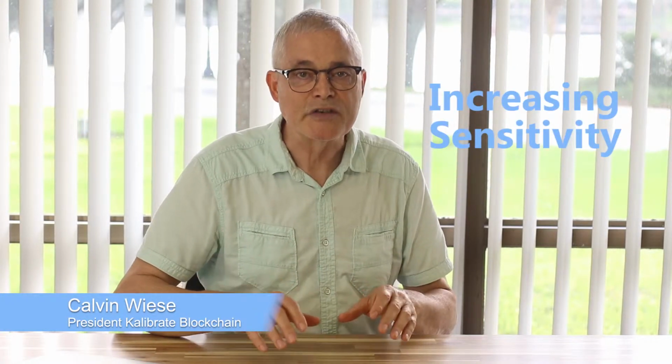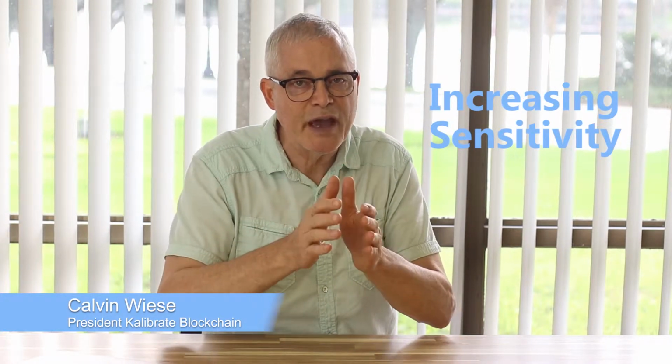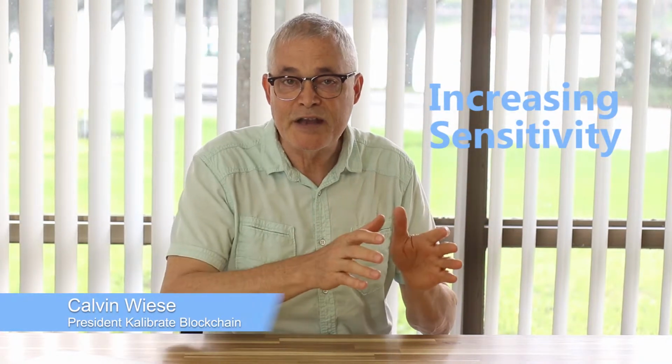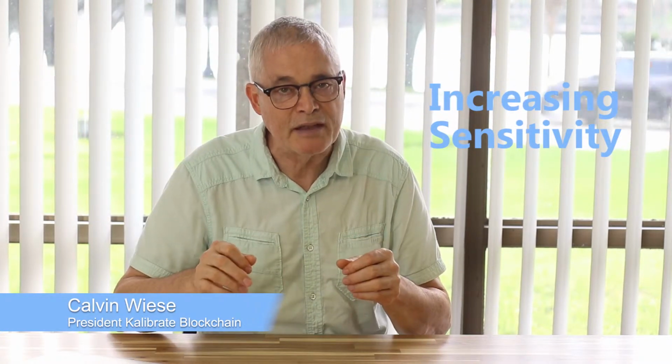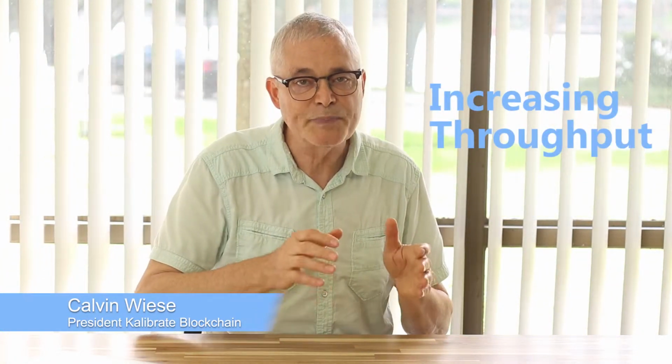Dr. Yost taught us that we can increase sensitivity by getting the analytes closer together. So if we can isolate the analytes from the other molecules in our isolator and then remove most of the solvent carrying the analytes, we can achieve the high sensitivity we seek. Dr. Yost also taught us that mass spectrometry instruments are idle most of the time. As much as 99% of the time they're idle. During that idle time, the instrument is waiting for the analyte to be injected.